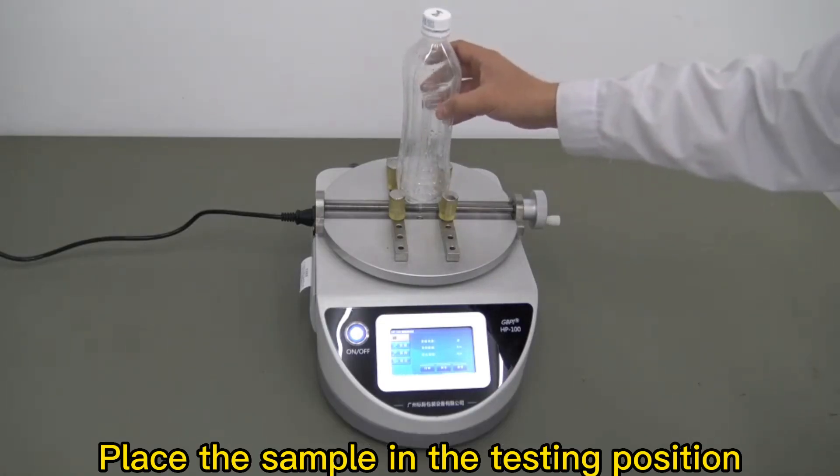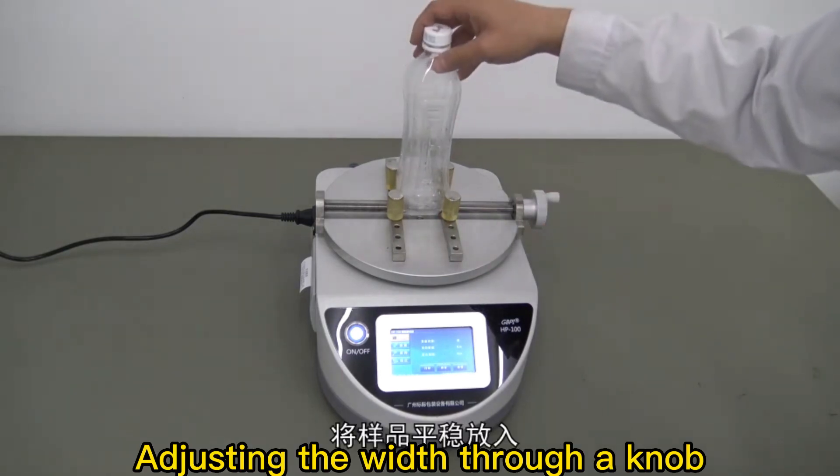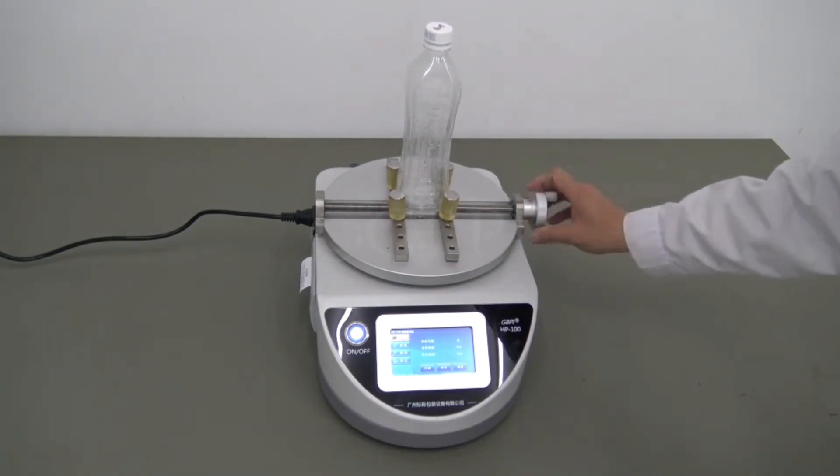Place the sample in the testing position, adjusting the width through a knob. Stabilize the sample and tighten it to secure it. Then click clear.